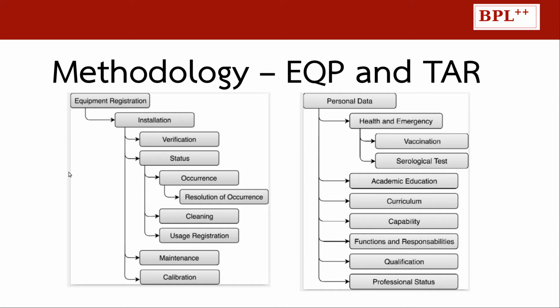So for example, if an equipment is down because it has generated an error, it can be registered here and then it can be searched for later, as well as the resolution of the occurrence. So it's easy to specify everything that has happened and all the solutions for the problems. Cleaning usage also can be registered in this workflow.